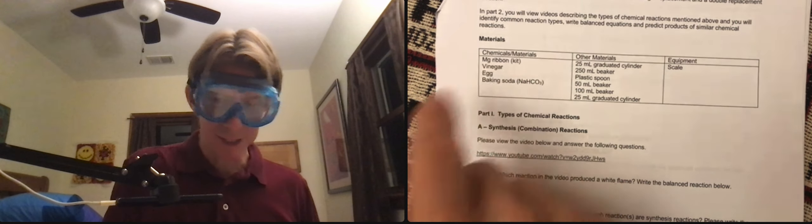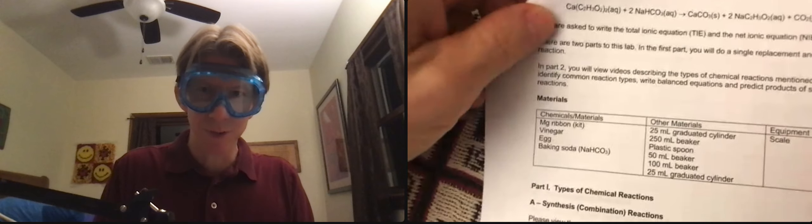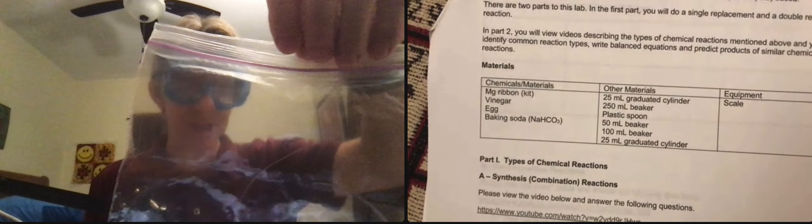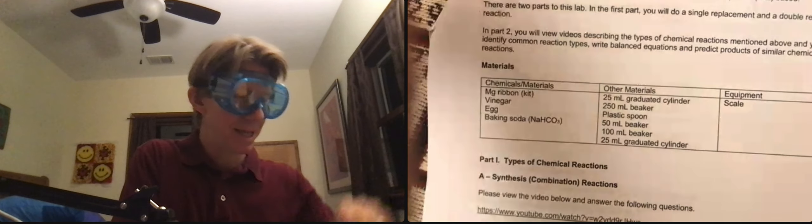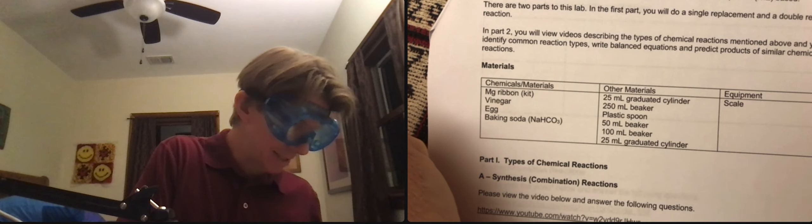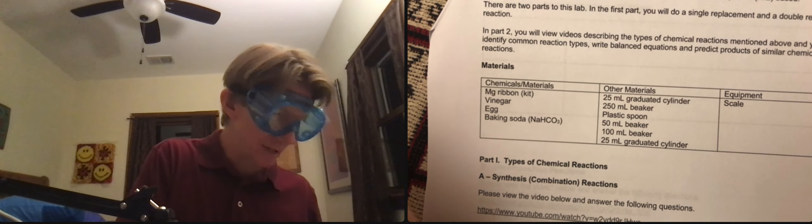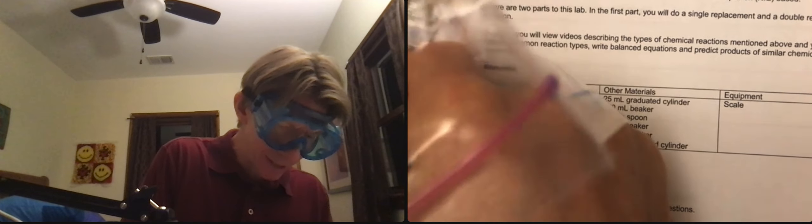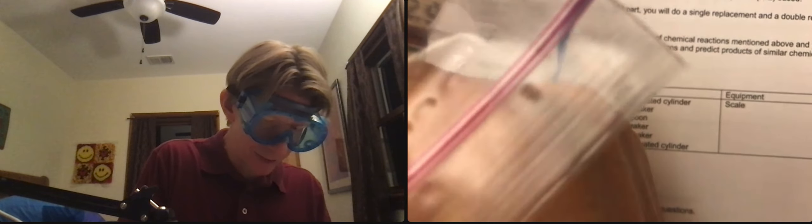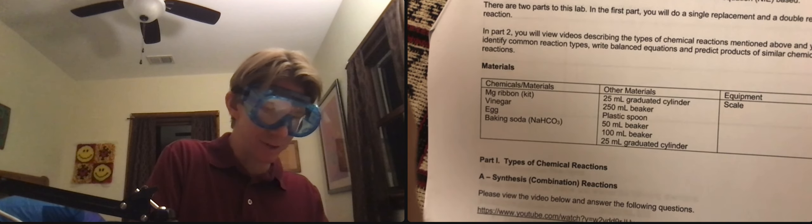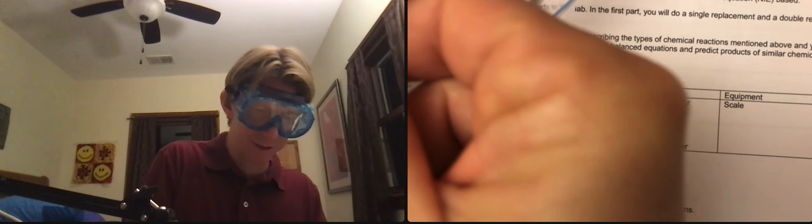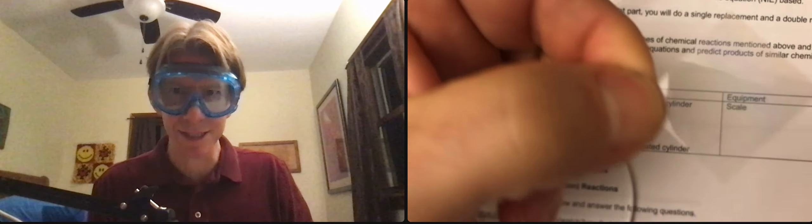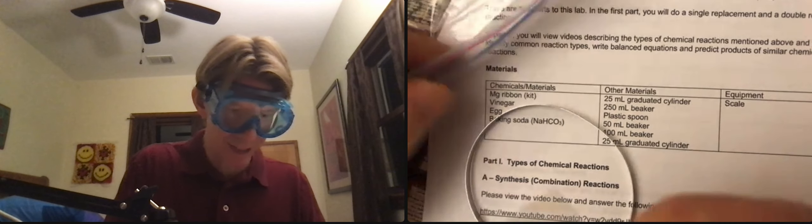The first thing on our material list is the magnesium ribbon, and that's in your kit. It comes in a plastic bag and this plastic bag has two things in it: the magnesium ribbon and a diffraction grating. The diffraction grating just looks like a little tiny square piece of plastic, and try not to touch it except at the very corner. Don't lose that because we'll need that for the next lab.